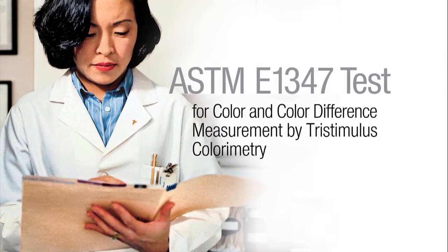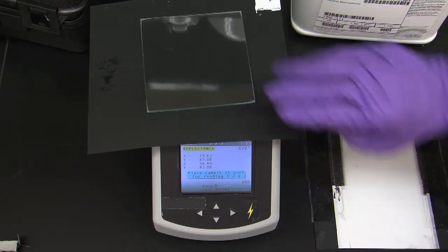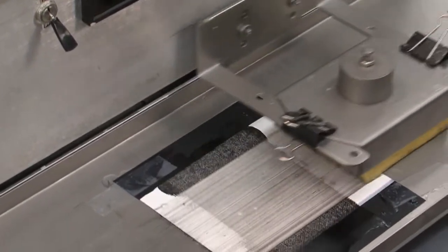Reflectance is key in the washability test. We use a tri-stimulus colorimeter to measure color difference by means of reflected light. We measure the reflectance both before and after the washability test to see how well the painted surface recovers from soiling and washing.